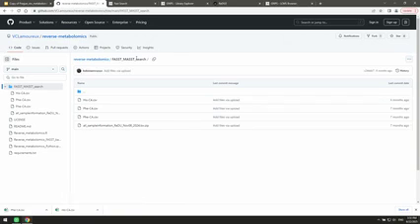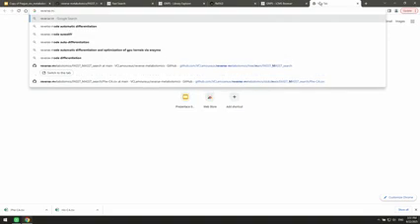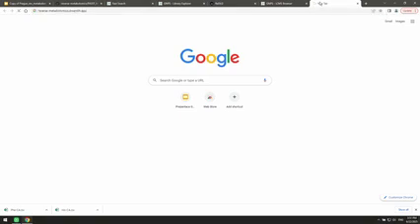All right, so I think a lot of you probably had issues while running the R code earlier. So we just recently made an app to hopefully make things easier. I'm just going to pull it up right now.